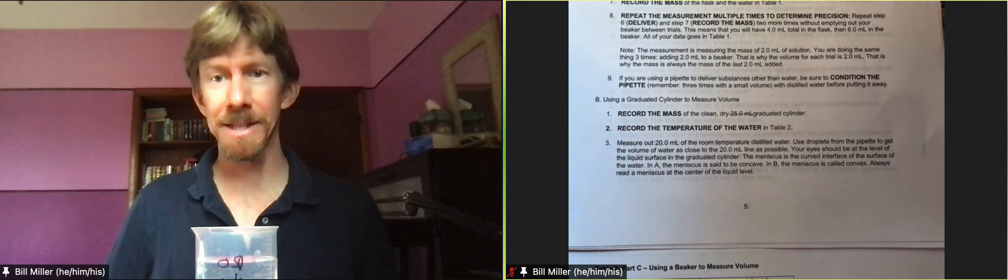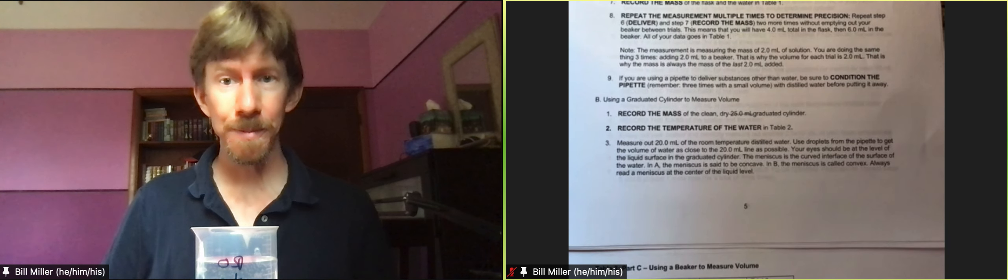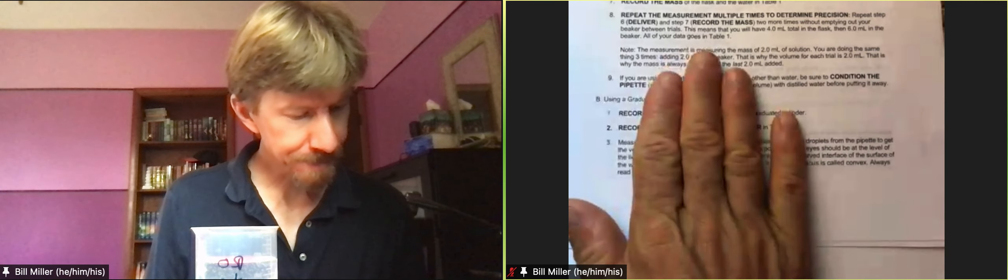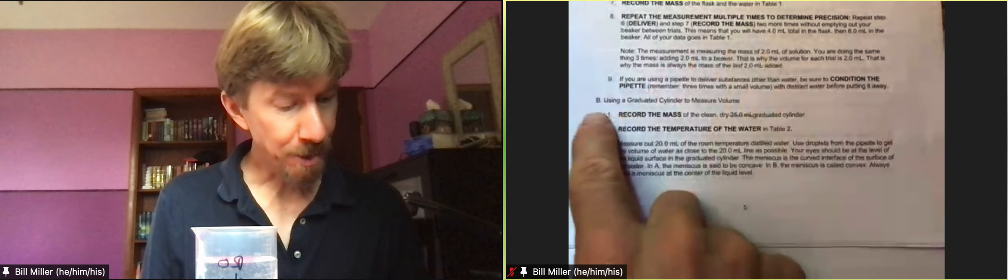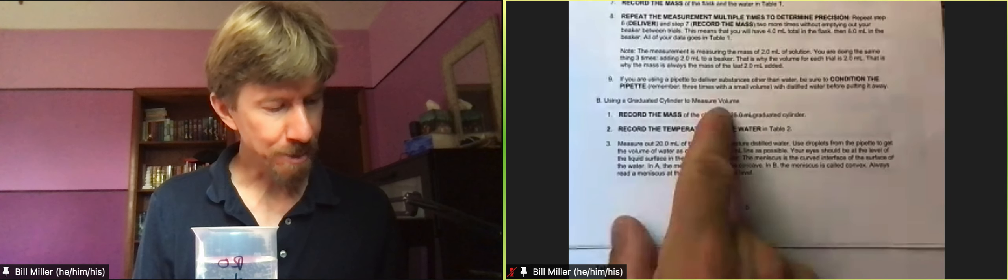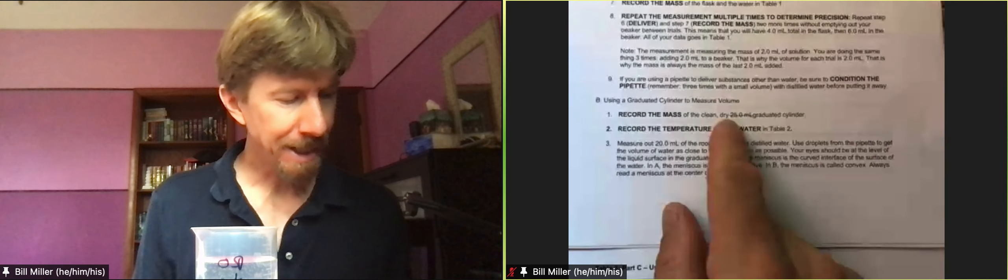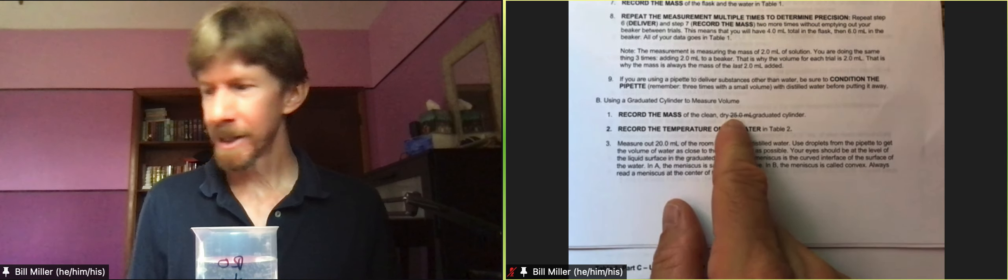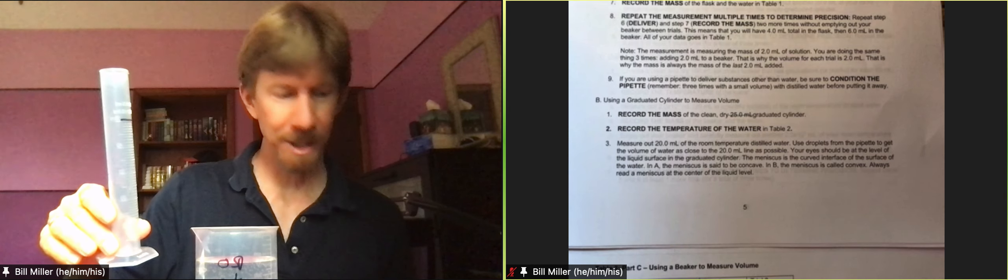This is experiment one basic techniques, table two. I've got my procedure here for Part B: using a graduated cylinder to measure volume. It says record the mass of the clean dry graduated cylinder. I think I have the edited version that I accidentally printed out. Previously we said it could be a 25 or a 50 milliliter graduated cylinder.